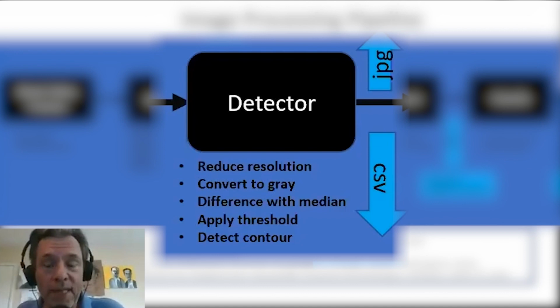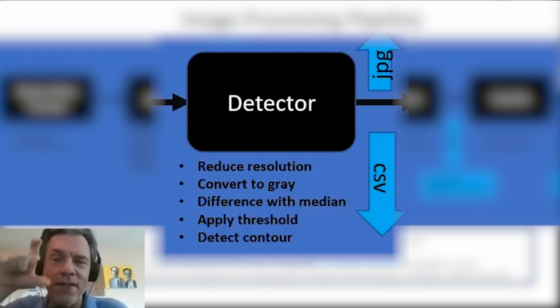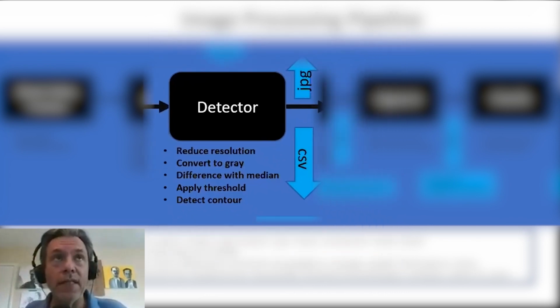It also spits out images of objects, which is really important for humans labeling it, because they'll say, oh, that's a stentor. Also, you noticed we had that fancy microscope I mentioned with lasers. That one is good to have the individual images because we can instruct the higher resolution images. So that is the detector.